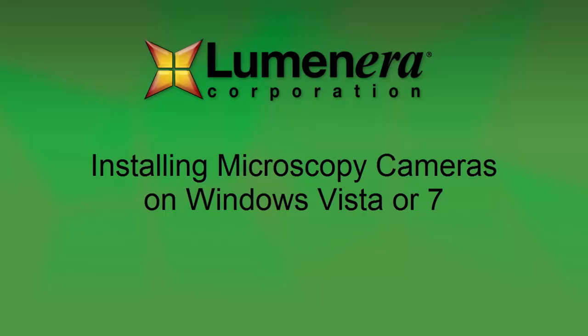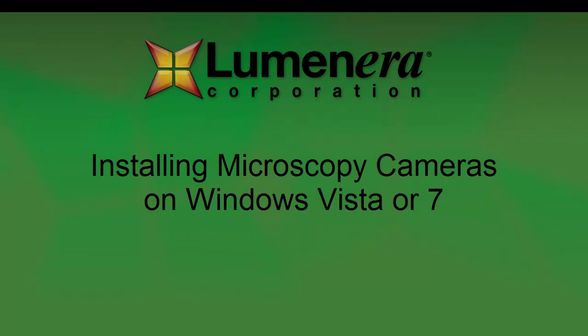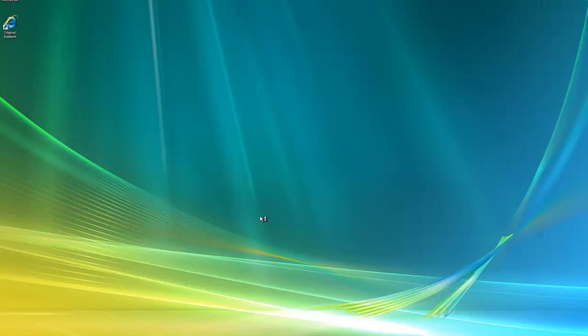This is a short tutorial showing you how to quickly install your new Lumenera microscopy camera on a computer running Windows Vista or Windows 7.